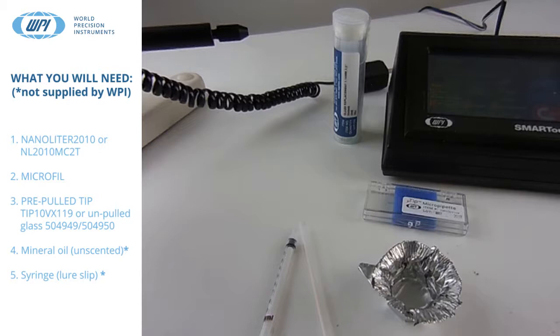Nanoliter 2010 or NL2010MC2T, MicroFil, pre-pulled tips part number TIP10VX119 or un-pulled glass part number 504949 or 504950, mineral oil unscented or uncolored, and a syringe with luer slip.